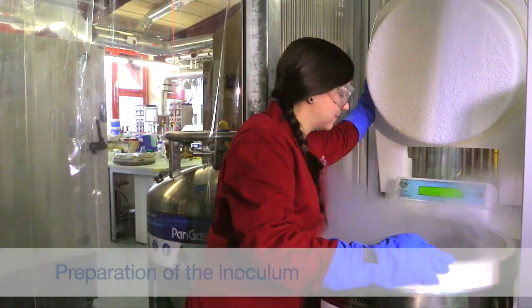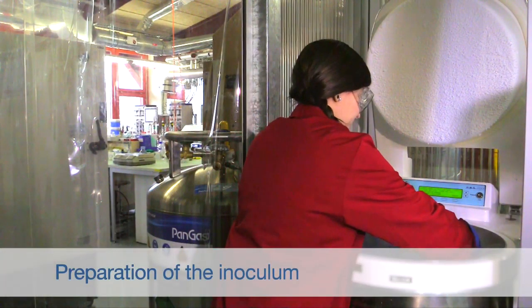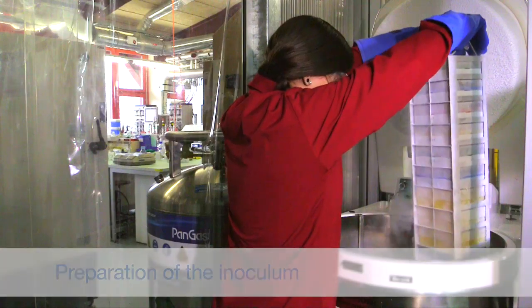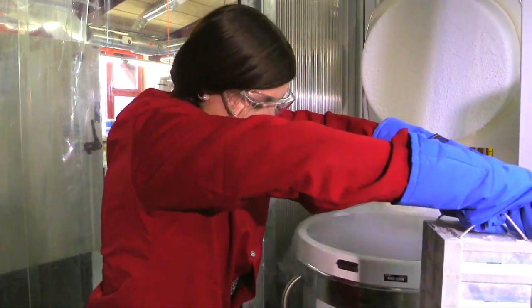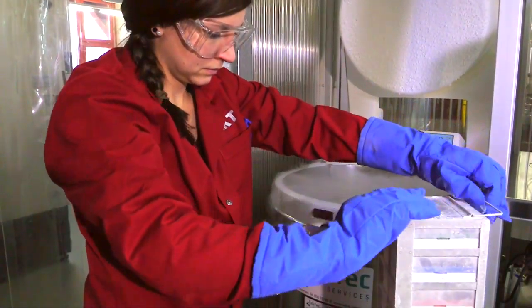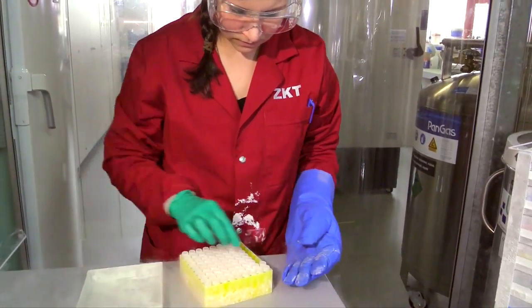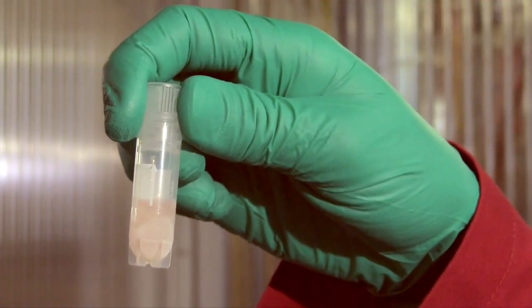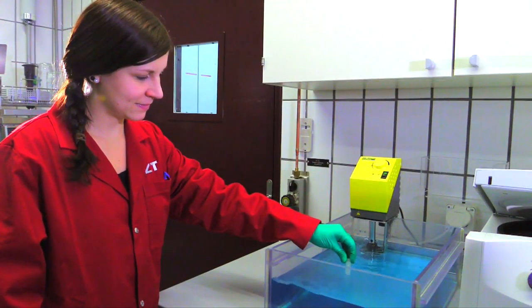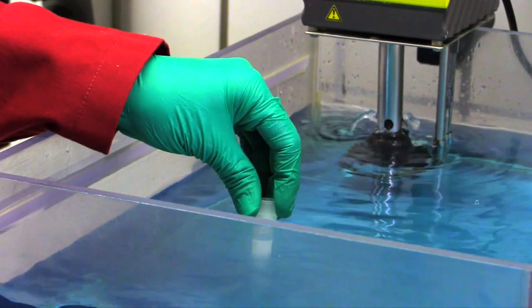For inoculation of every spinner flask, cells from the vial-based working cell bank are used. First, the vials are taken out of the liquid nitrogen storage tank. One vial provides the inoculum for 8 to 10 spinner flasks. The vials are thawed in the water bath at 37 degrees Celsius for approximately 2 minutes.